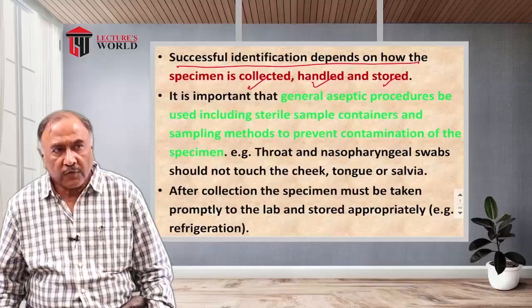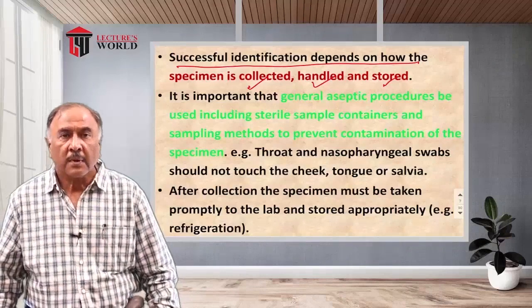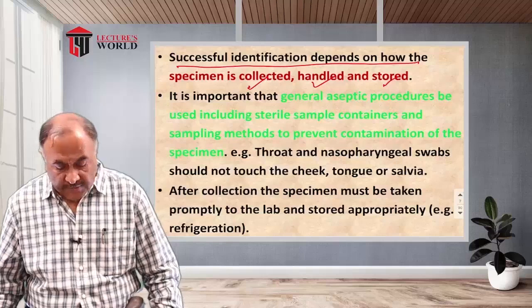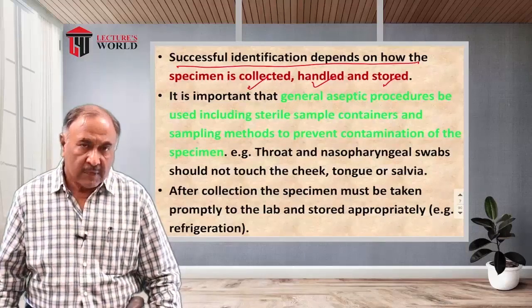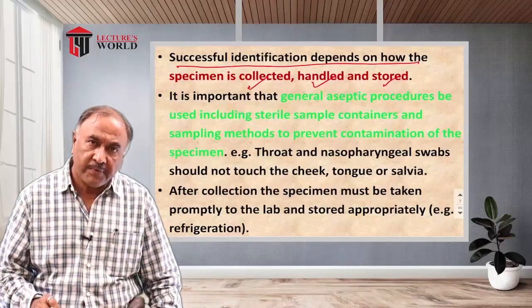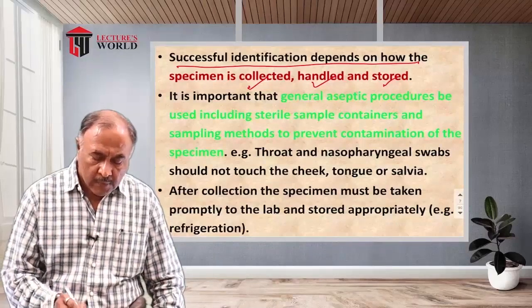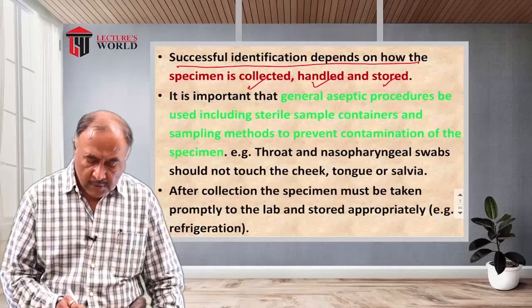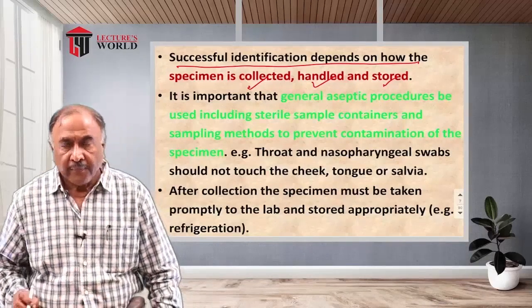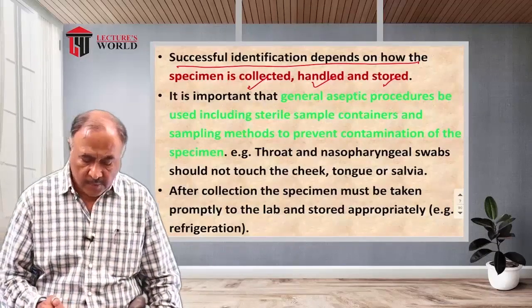Normally, a microscope is an instrument which is used for seeing smaller objects, and therefore the essential criteria for observing a microorganism involve magnification, resolution, and contrast. These three are very fundamental for any microscopic observation.